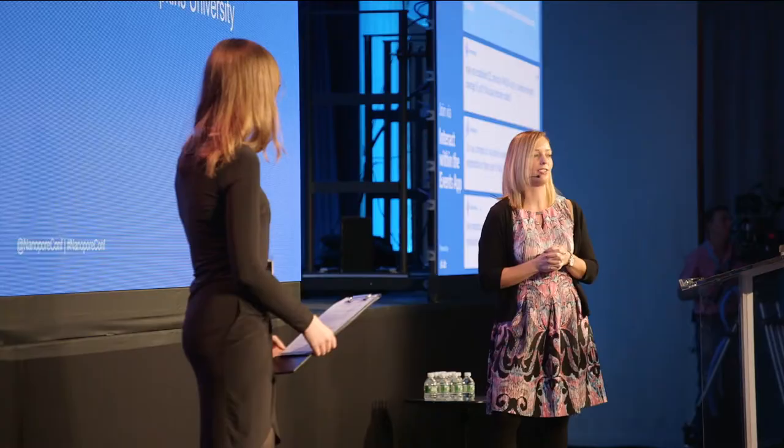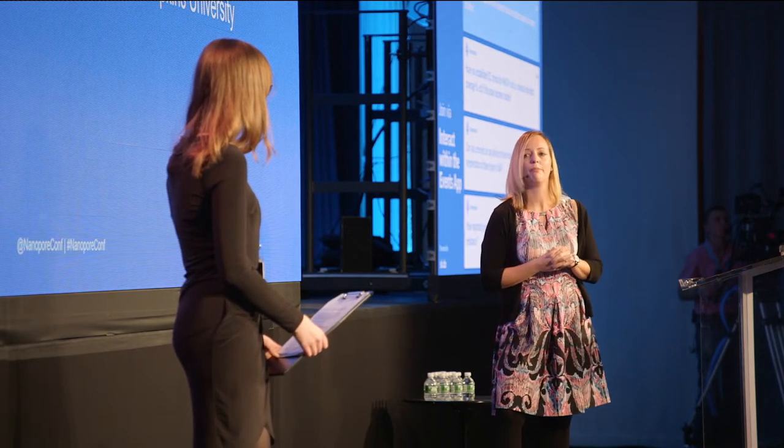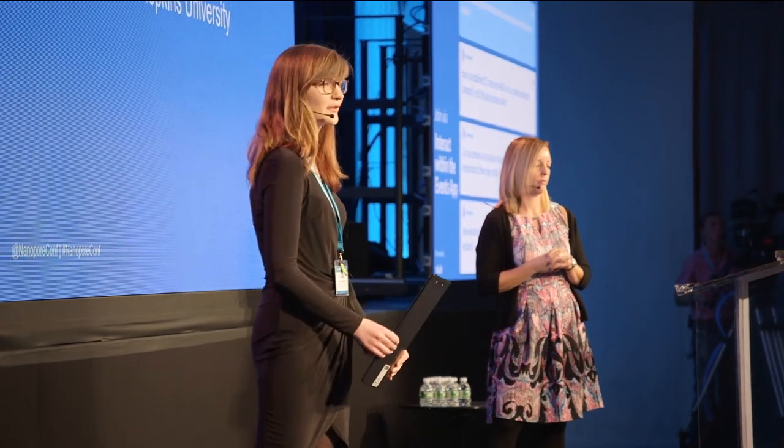But the proteomics analysis is really going to be where it's going to come from in the end. I think if we could show that those genes are truly being expressed, then I think that'll be a more reliable way in the end. But I do think even just detection of resistance genes is something that can come our way in the clinical lab. Fantastic. Have we got any questions from the floor?